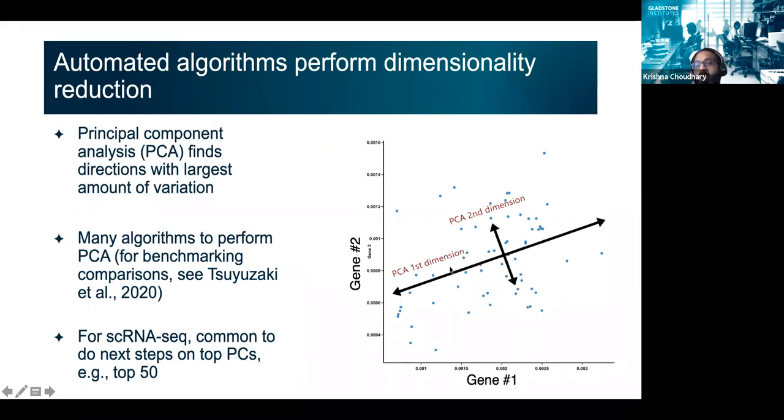So first we want to either reorient our data, or project it, so that we are looking at it from the perspective of, let's say, 10, 20, 30, 40, 50, a certain number of dimensions, but fewer than 20,000, the total number of genes. We are going to reduce it to, let's say, 50 dimensions of hidden factors.